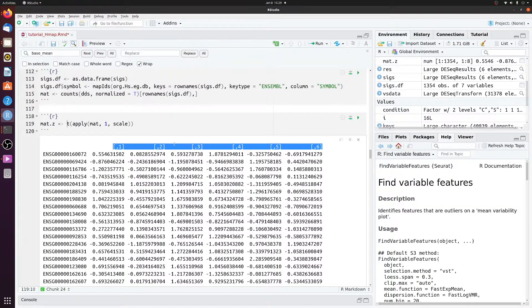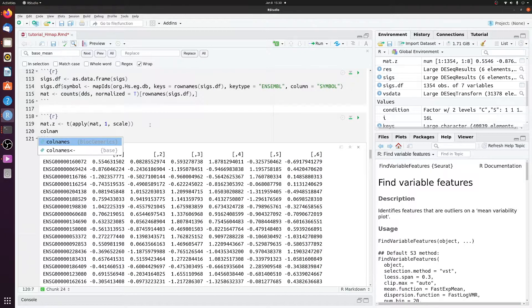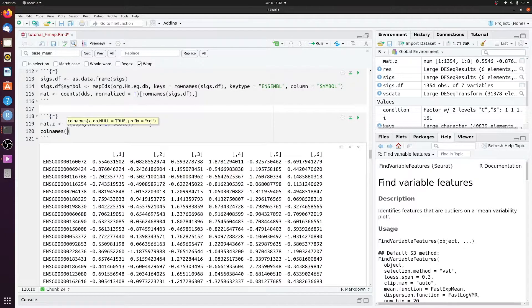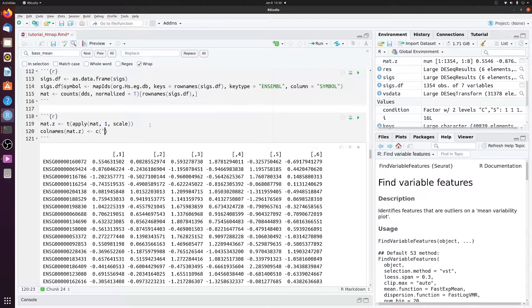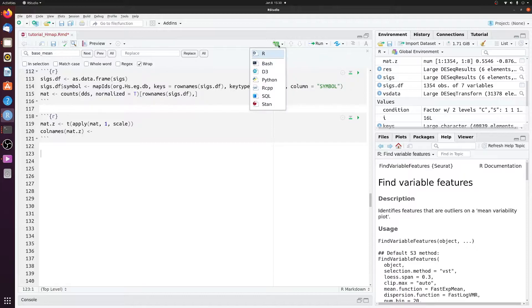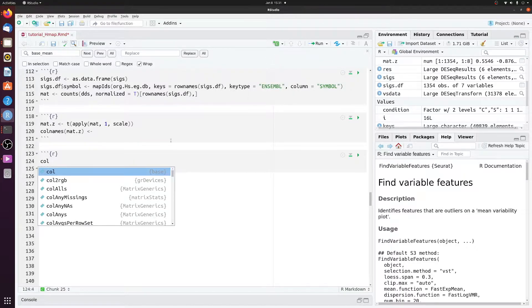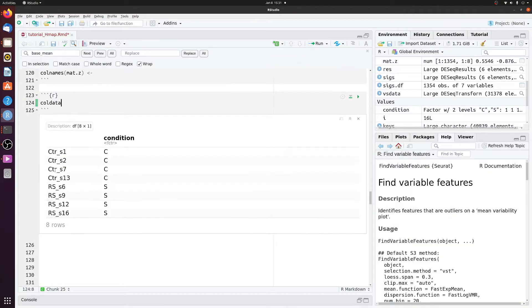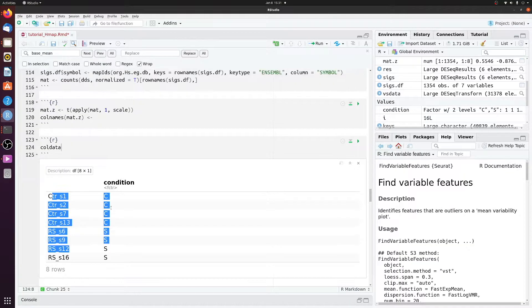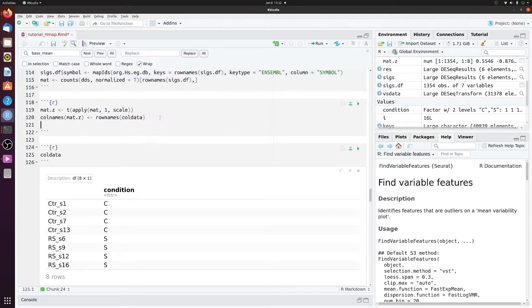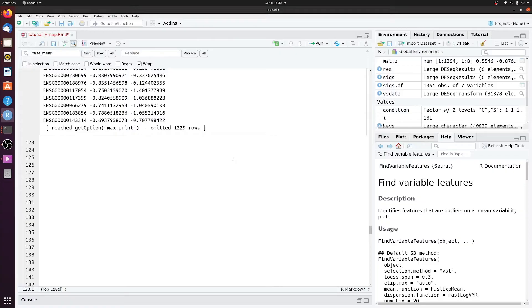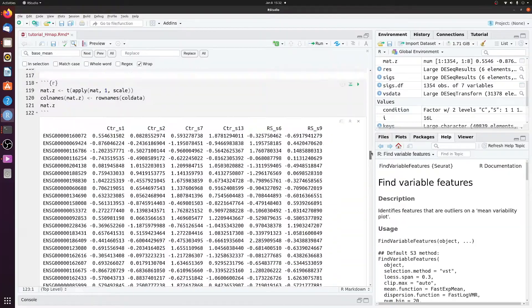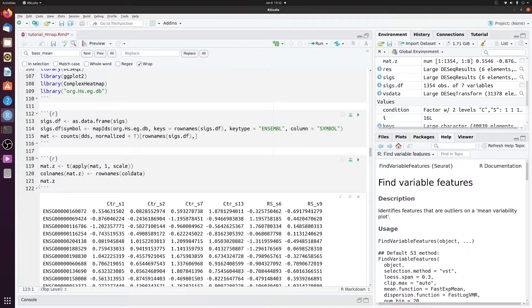And then we just want to rename these. And they're going to be in the same order as your counts table. So we can do call names mat.z, and then we can set it to a vector of our column names. Or in this case, we can just use our call data from earlier, which was just a table with the sample names. So we can just use the row names of call data. Now if we look at mat.z, we now have the columns named correctly.